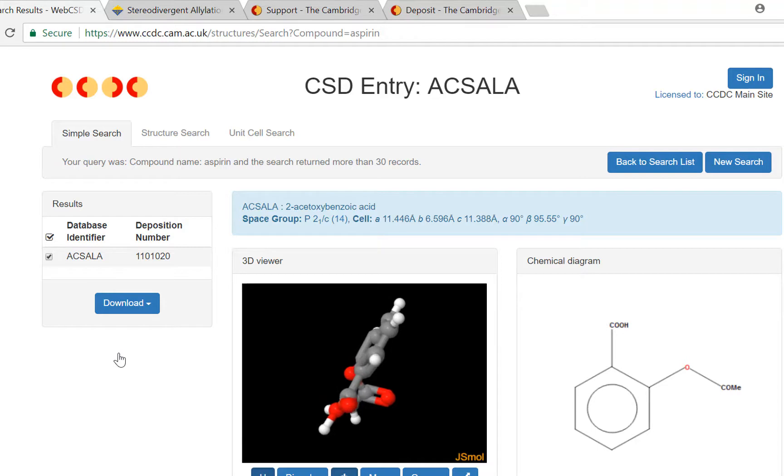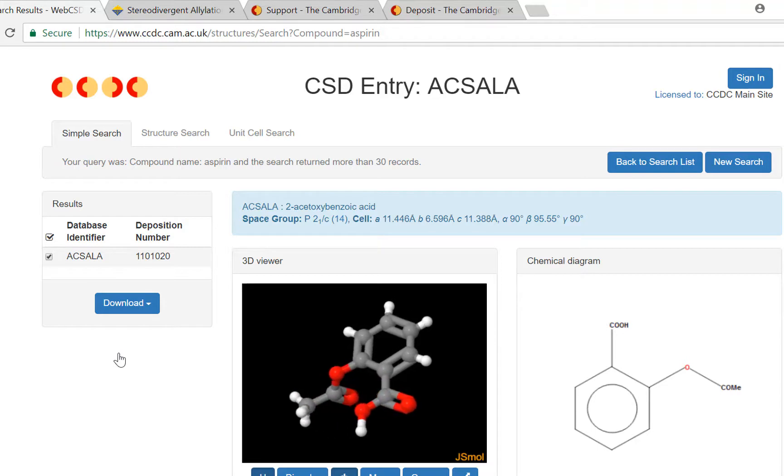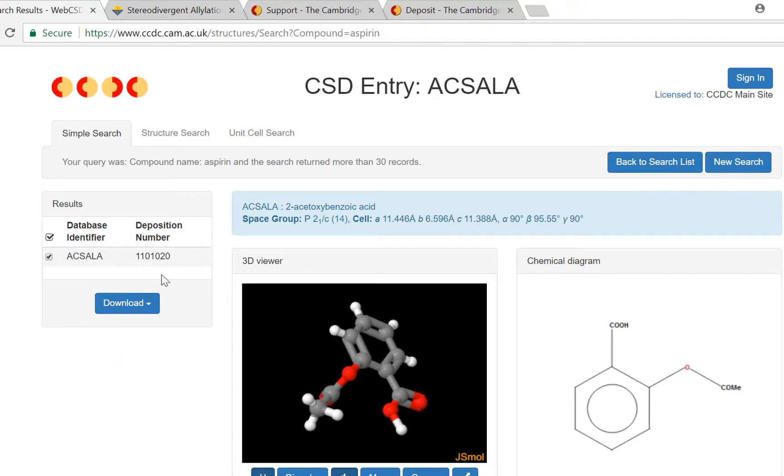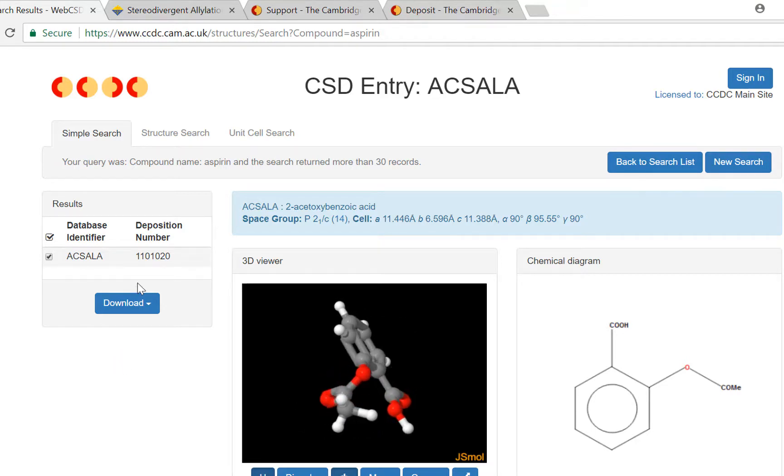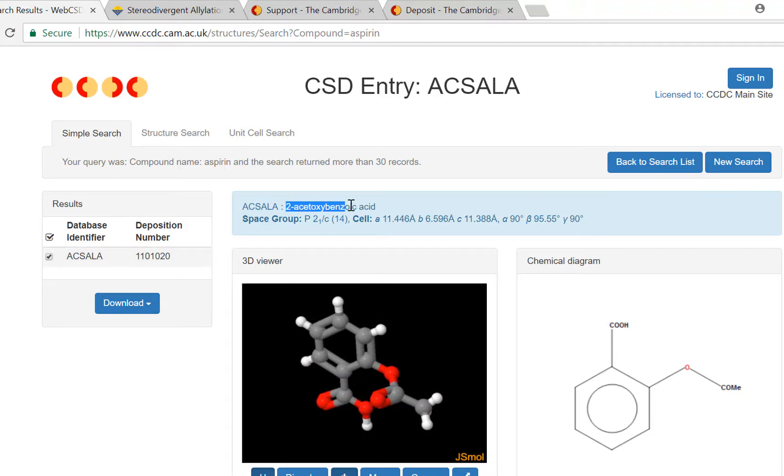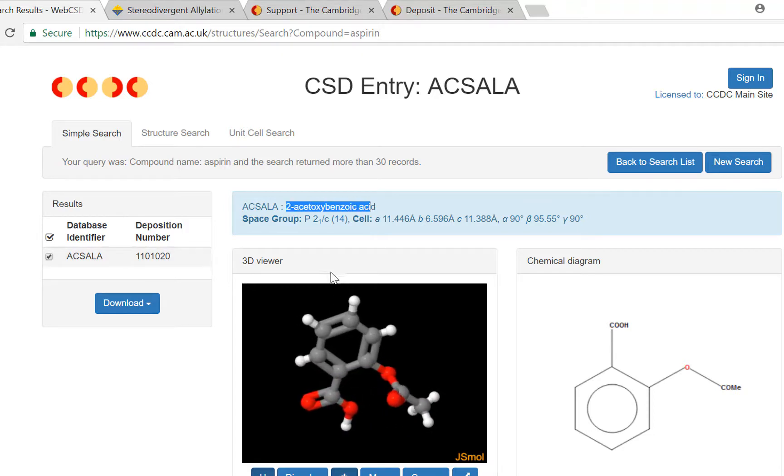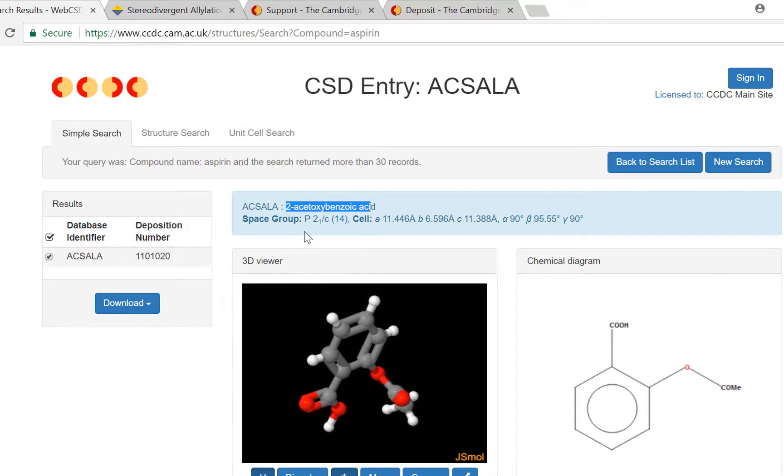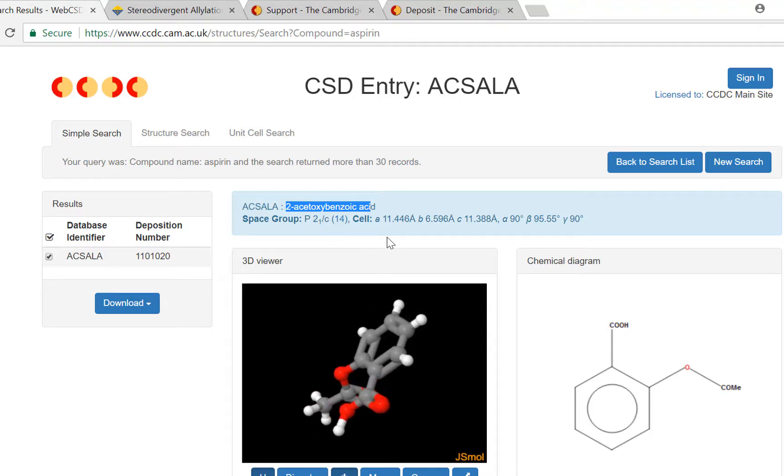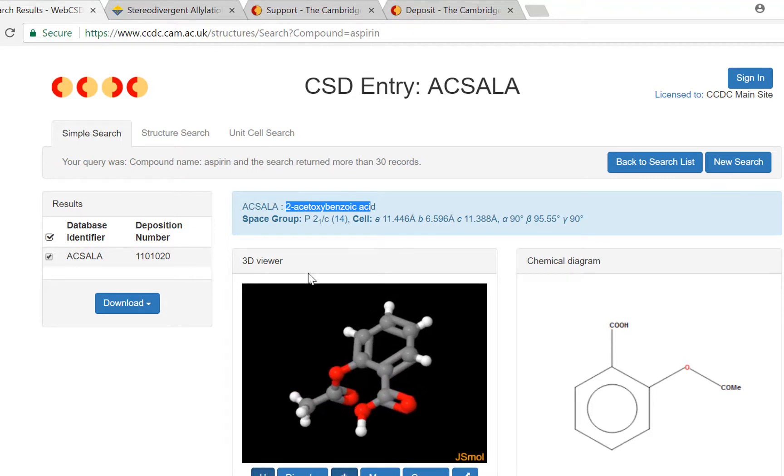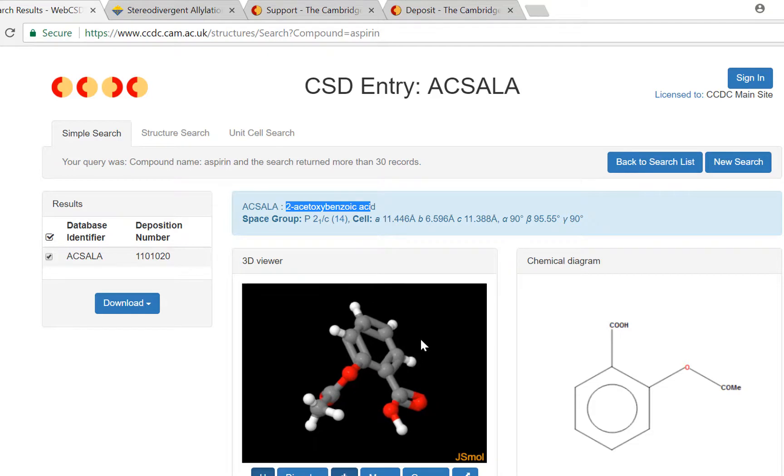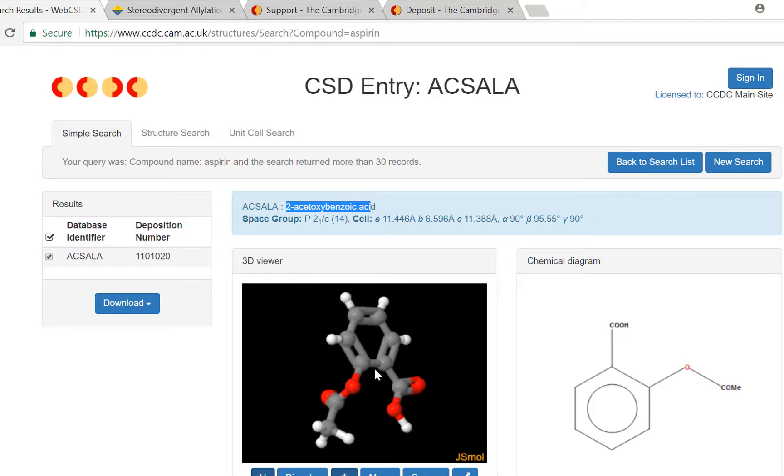Now I can see more details about aspirin: the number the dataset was given at deposition, the deposition number, the compound name, crystallographic details, the space group and the unit cell measurements. The structure can be visualized here in the 3D viewer.